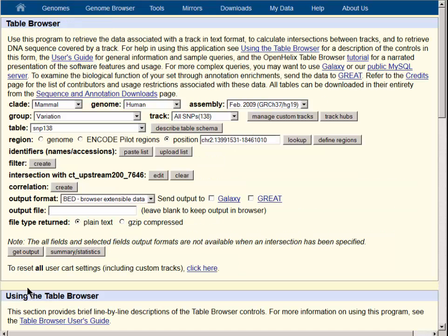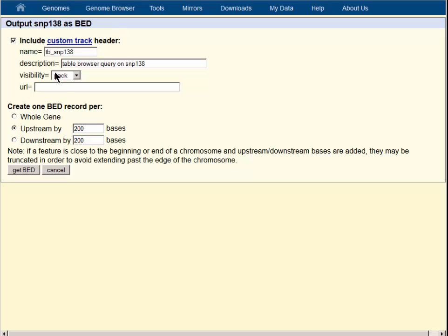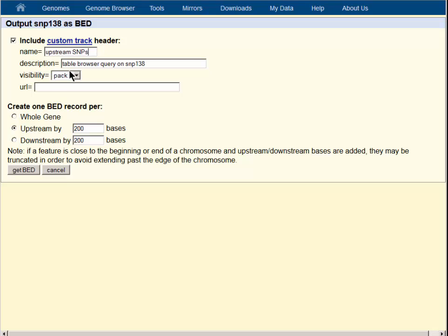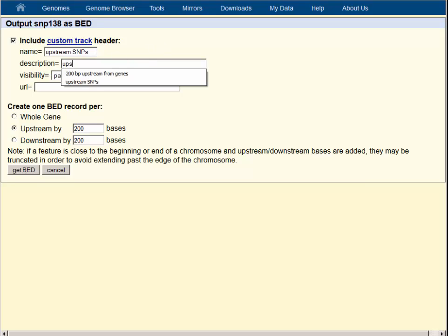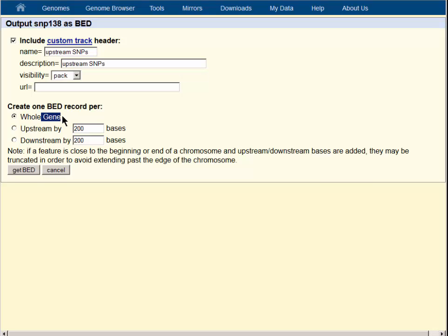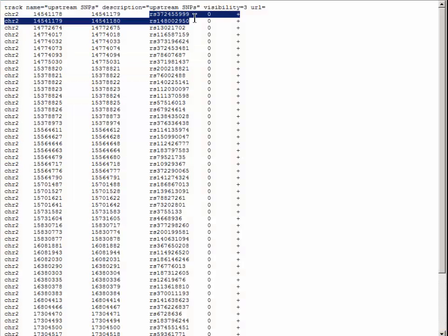Here's where we choose our output data format. Once again, we will choose browser extensible data and get our output. Let's include a custom track header here as well so that we can see on the browser the results of our work. We will call this upstream SNPs and we will get one bed record per SNP, and then the get bed choice gives us our SNPs.